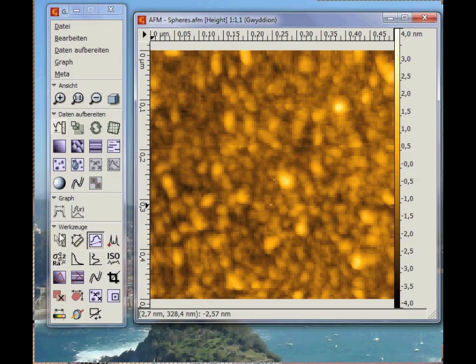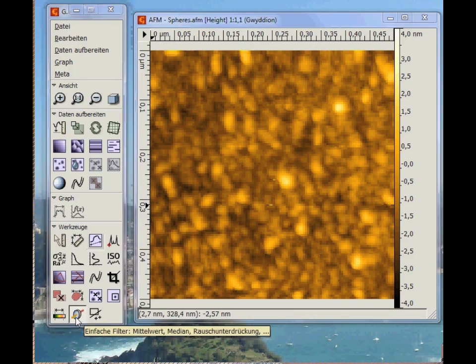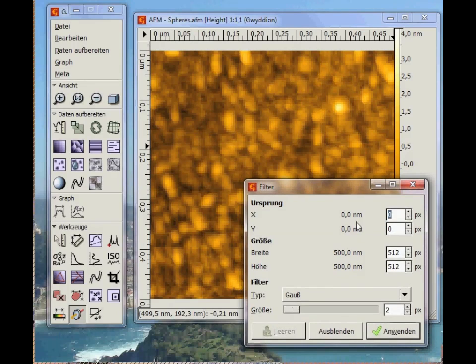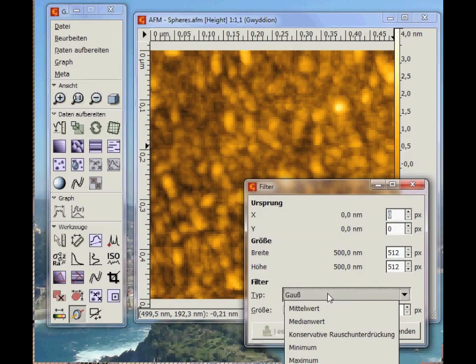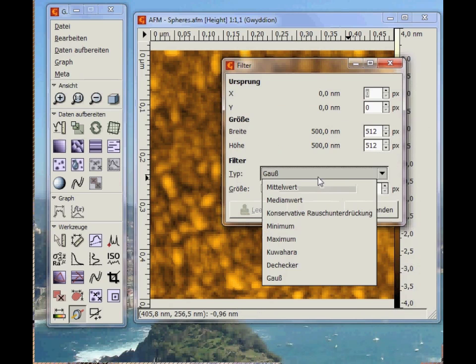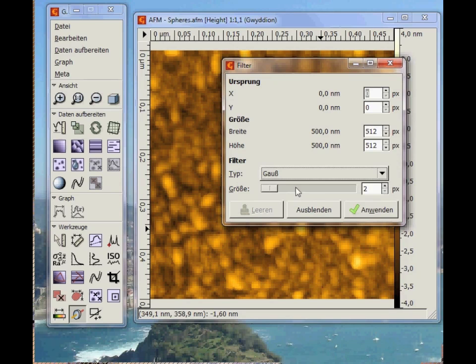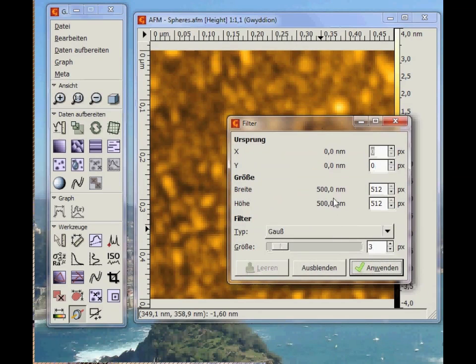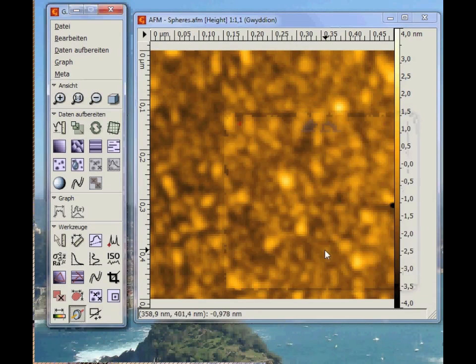Now let's take a look at basic operations. For that, you click on the simple filters. In the new window you select your filters, such as a Gaussian, median value, and so on. Let's select the Gaussian filter to blur and smoothen the data a little bit. Applying this gradually blurs the whole image, but you can also select only a part of the image and apply the filters there.